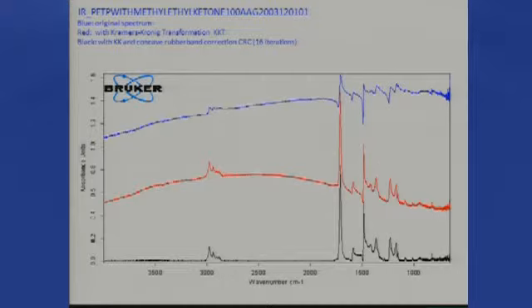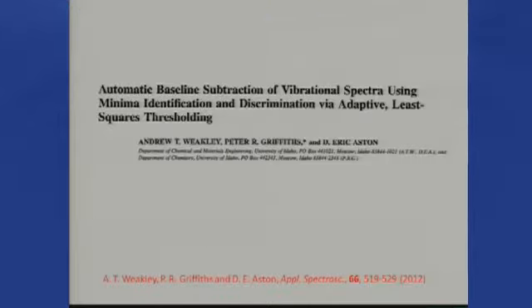Looking at the SEIRA spectrum, which is one that I really wanted to look at, the first thing they did, being good spectroscopists, was to do a Kramers-Kronig transform, which was the last thing I wanted, unfortunately. But again, even after the Kramers-Kronig transform, there was still some distortion of these bands. And again, you can see, if you look carefully, that this is really all positive. And so working with this sort of technique does not work with bipolar spectra.